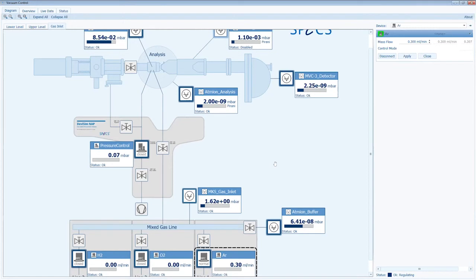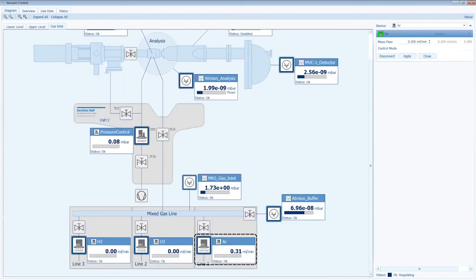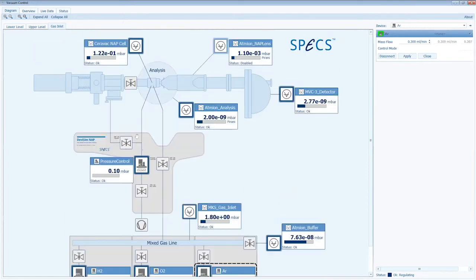And I think I probably didn't close the valve. Maybe I did already. Okay, already closed. However, I see the pressure inside the cell is increasing. Now it's 0.1 millibar. You can go to probably 1 milliliter per minute or something to reach it. Maybe we can work in this flow mode. Yes, so I can open the pressure controller, so I increase the efficiency of pumping.